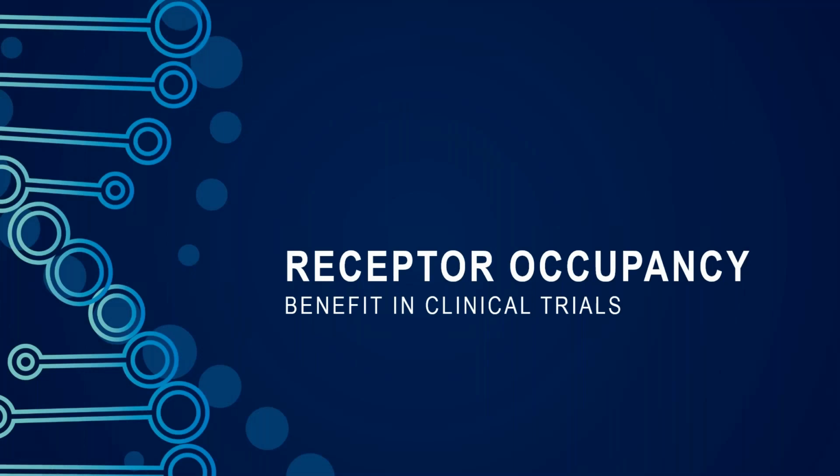Thank you for that introduction, Priscilla, on receptor occupancy. To close out this seminar, in the last part, I will just talk a little bit about how receptor occupancy can be used in clinical trials.